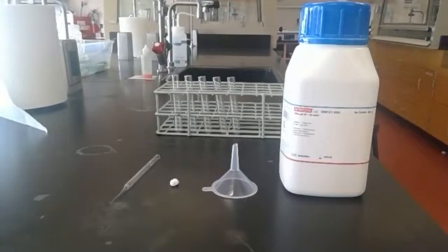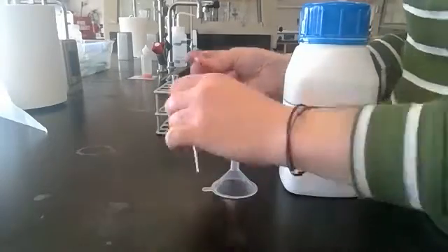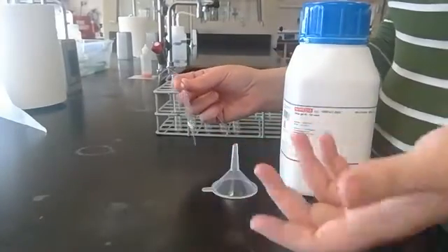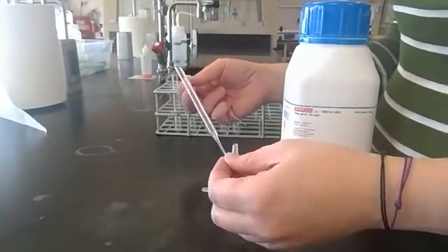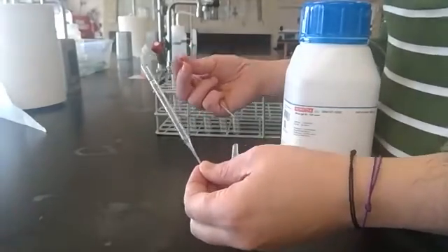In this video, we're going to do a chromatography demonstration that's going to utilize a polar stationary phase and a less polar mobile phase. So I've got my equipment out here and I'm going to show you how I construct this. This is actually a technique you'll use oftentimes in organic chemistry labs, research labs, when you're trying to determine what concentrations of solvent would be best used in a silica gel column to separate multiple compounds. And so we're going to make essentially a mini column for column chromatography.